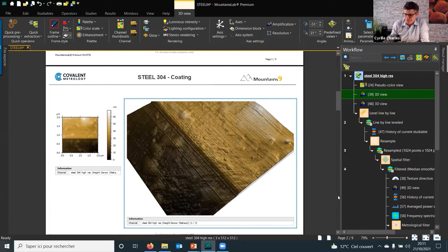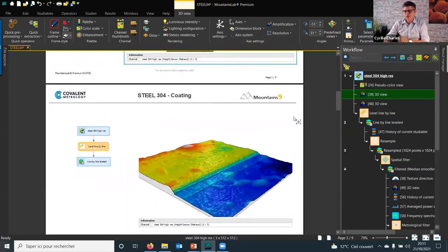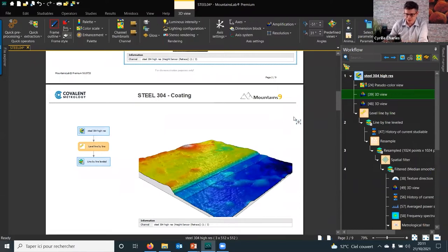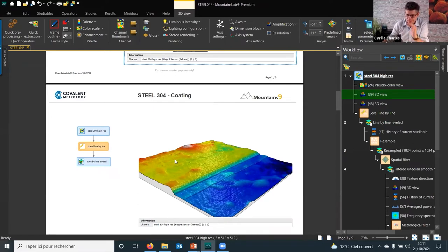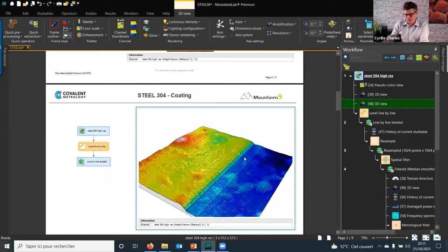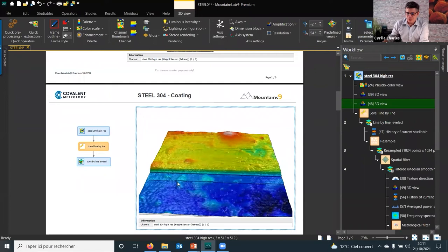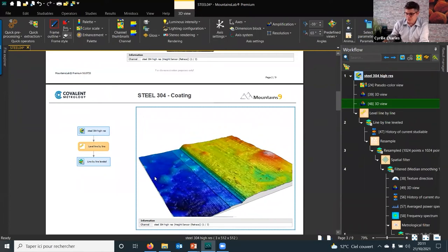On the next page I wanted to display the same surface but with a different range of color — we call it the palette. I changed the palette and I can see information in the background and also on top of the surface, but I still have some lines. Those lines are well known in AFM and SPM technology — they are due to the scanning process.